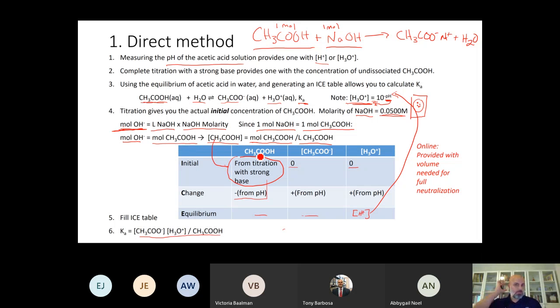So you can see with essentially more or less two measurements, one titration-based measurement to figure out the quantity of sodium hydroxide needed, and another one a pH measurement, we can calculate the Ka expression or the Ka value of acetic acid. So in this particular part, the data that you're going to be provided here, right?